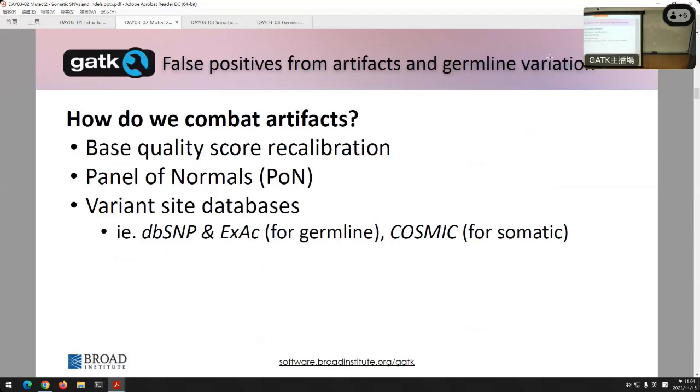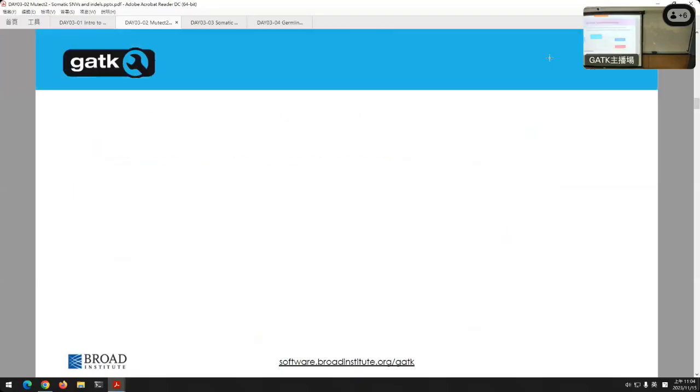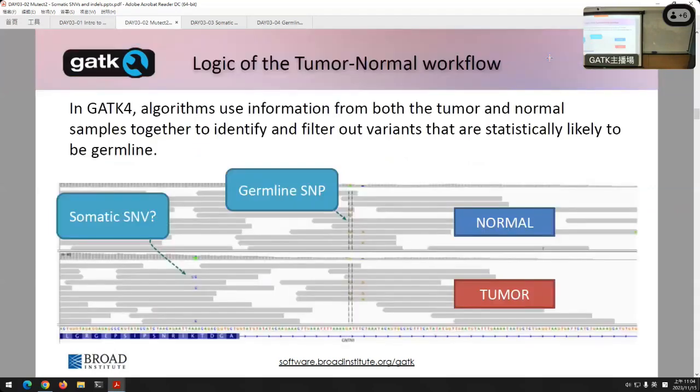So like I said, what if you don't have enough evidence to say this thing was probably a germline mutation? Well, what if you find that that mutation is present in dbSNP or gnomAD, and it's very common and is not really referenced in a specific somatic database? Well, that gives you more evidence. Or vice versa, you see that actually that's not a known common mutation in the germline, but it is present in a lot of cancer cells. Again, that's evidence the other way. So using these kinds of distributions can really help in making the calls in edge cases. And things can get a little ambiguous when you're talking about somatic cells, for many reasons we'll go into.